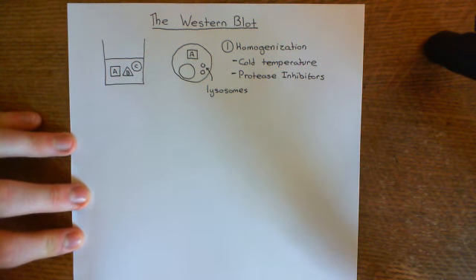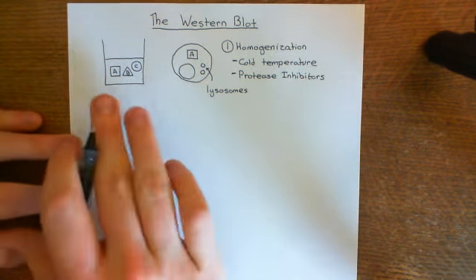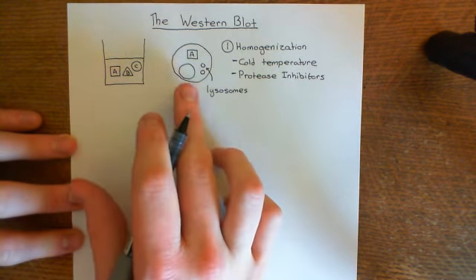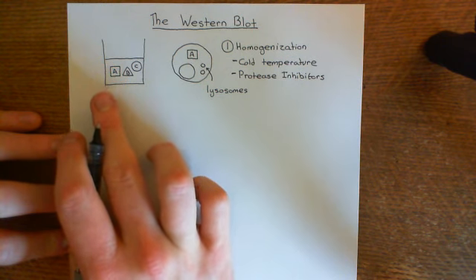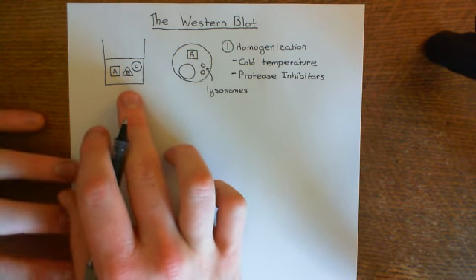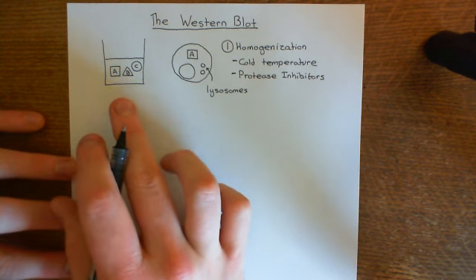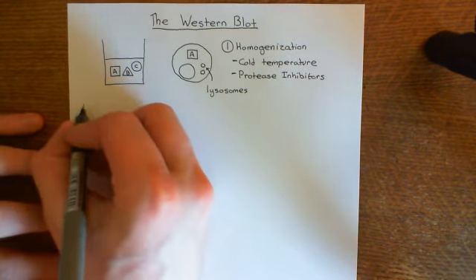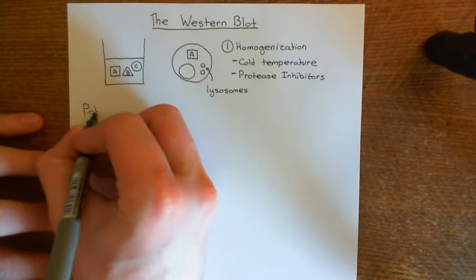Okay, now what we're going to do then is separate out the different proteins in this mixture, because now what we've got is a mixture of loads of different proteins, and we want to separate out these different proteins basically.